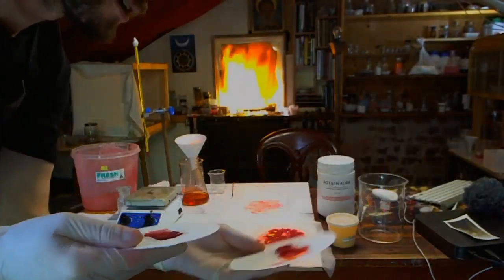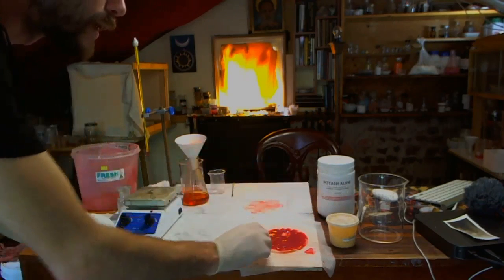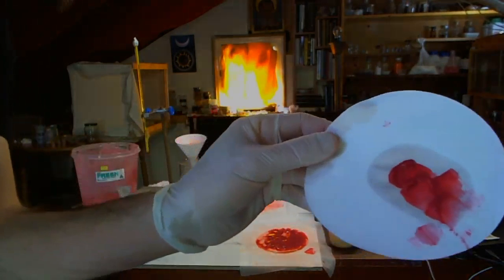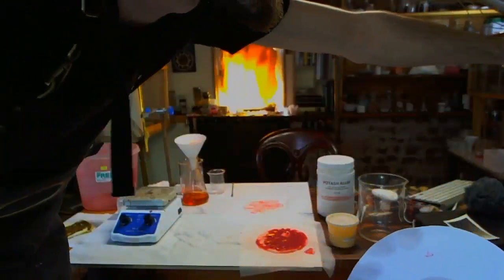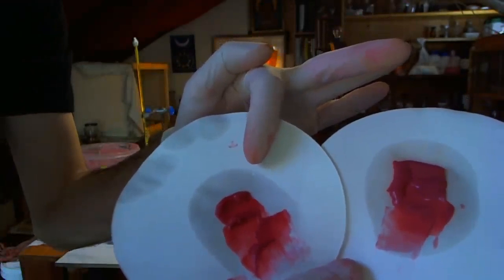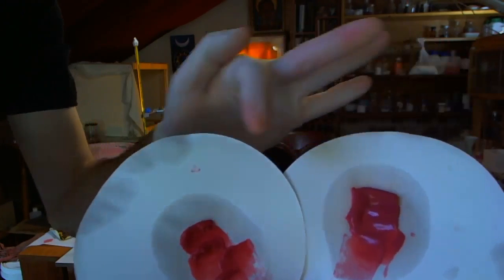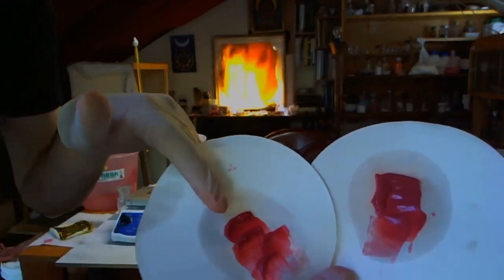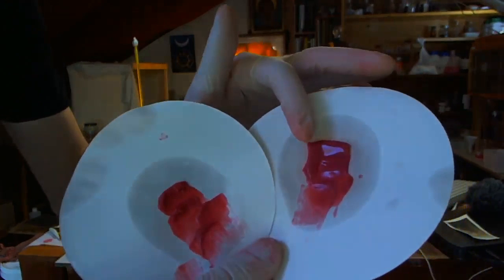Alright. Stupid cameras. Let's try and assess these the best we can. So that's the one we just got off the cotton wool, and that's the other one. Turn the camera. You can see that this one's got a dullness to it. There's a purpliness to it, and it's a little bit dirtier in color, whereas this one is a much more pure, perfect, vibrant red. So this is the one that we used the lead acetate on and the sodium sulfate to clean it up. This one was the pigment we got from the hydrochloric acid soak.